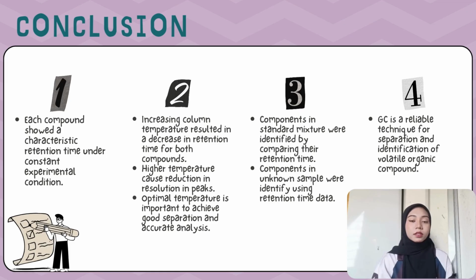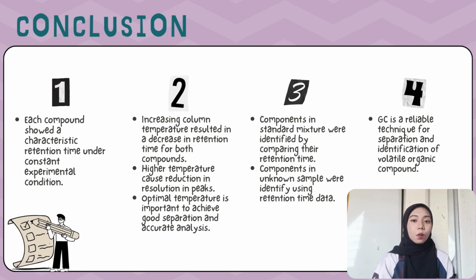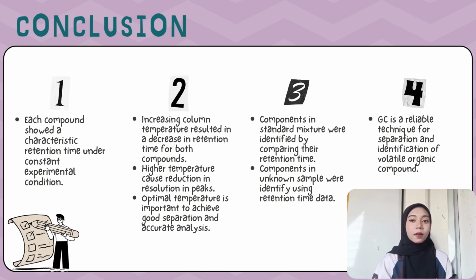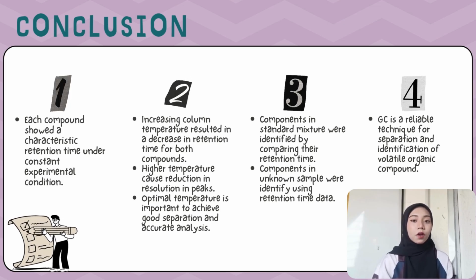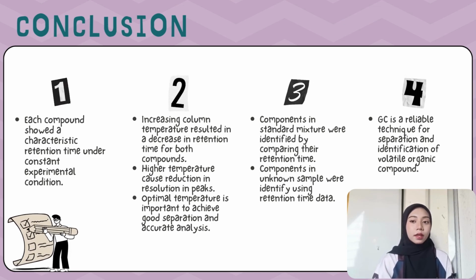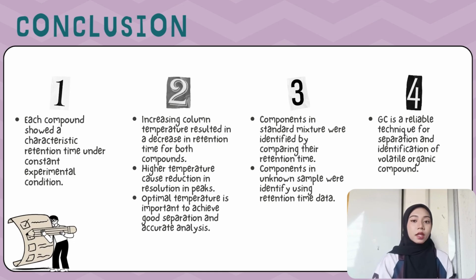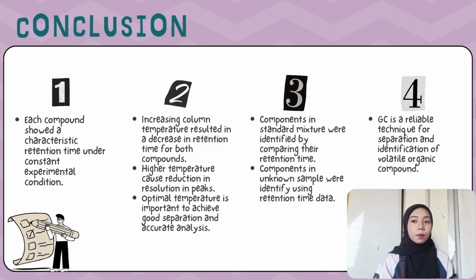Furthermore, the components in a standard mixture were successfully identified by comparing their retention times with known values. Using the same approach, the components present in the unknown sample were identified, proving the usefulness of gas chromatography in qualitative analysis. Overall, this experiment demonstrates that gas chromatography is a powerful and reliable technique for separation, identification, and analysis of volatile organic compounds based on their retention behavior.